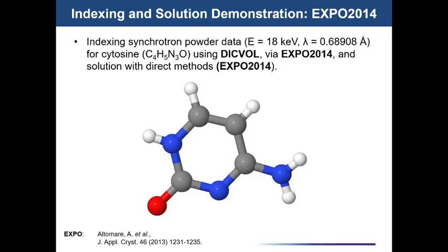Before you imported the data, was this with background subtracted? No, this is the native data. Though it subtracted it itself, I think, when it was doing, well, let me see, on the axis. I don't think it did. It'll do a little bit of manipulation as it does a Le Bail refinement, but I just imported the data as is. Well, as is after it was 2D data, so it was integrated.